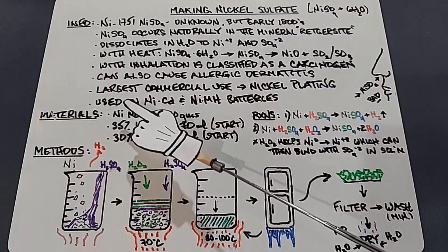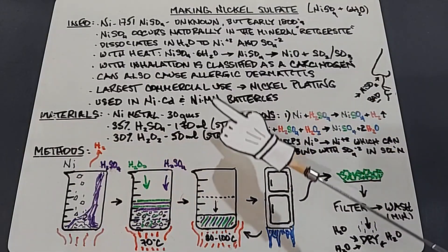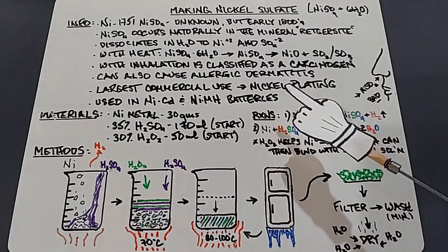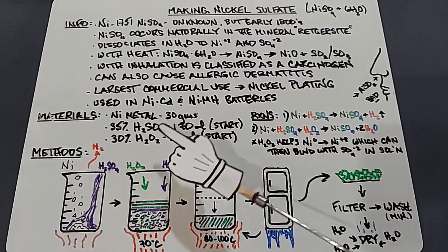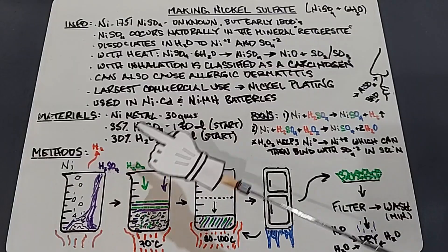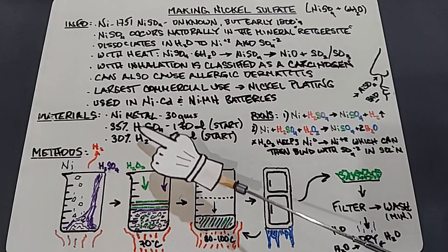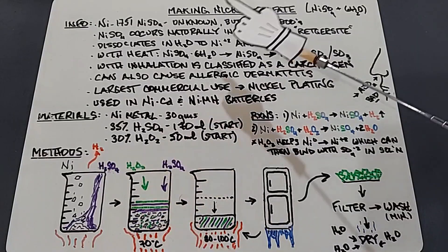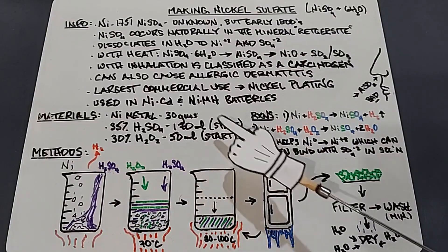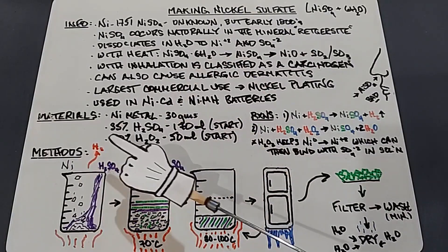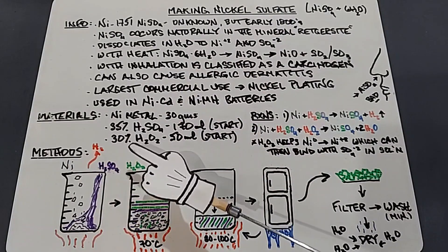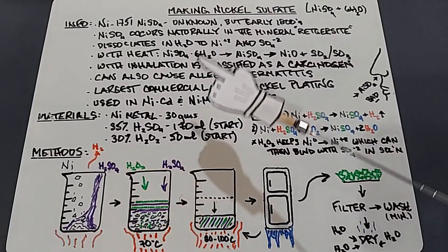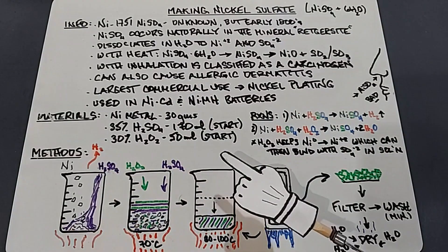In our materials we're going to use nickel metal - 30 grams, 35% sulfuric acid, which is basically battery acid strength in the U.S., and I'll start with 170 milliliters. We'll also use 30% hydrogen peroxide. I'm not going to mess around like I did with nickel chloride - we'll go right to 30%, 50 milliliters to start.